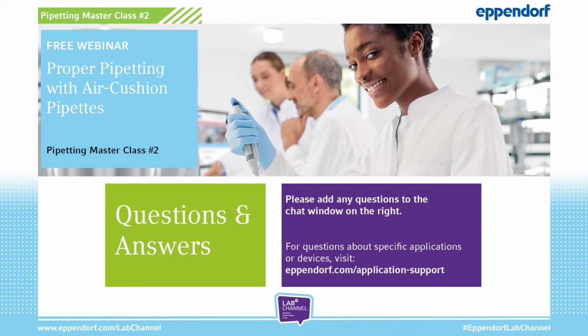Okay. Looking at the questions, I think we have another question which I am pretty sure that you can answer with your experience in cell culture applications. Do we have any advice on how we tackle or how they can tackle contaminations in cell culture? Does anything help other than sterile tips?